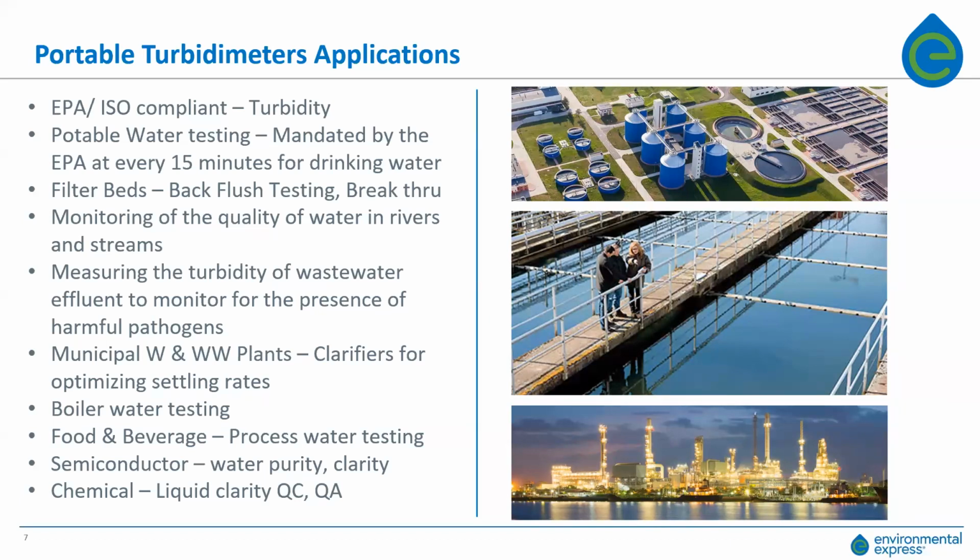of time determined by the operator, it can be a month, it can be 3 months, it could be 6 months. They need to be backflushed. The entire filter bed is backflushed, and then the water is pumped off, refreshing that filter bed so that it can continue to filter out fines and other specific impurities.